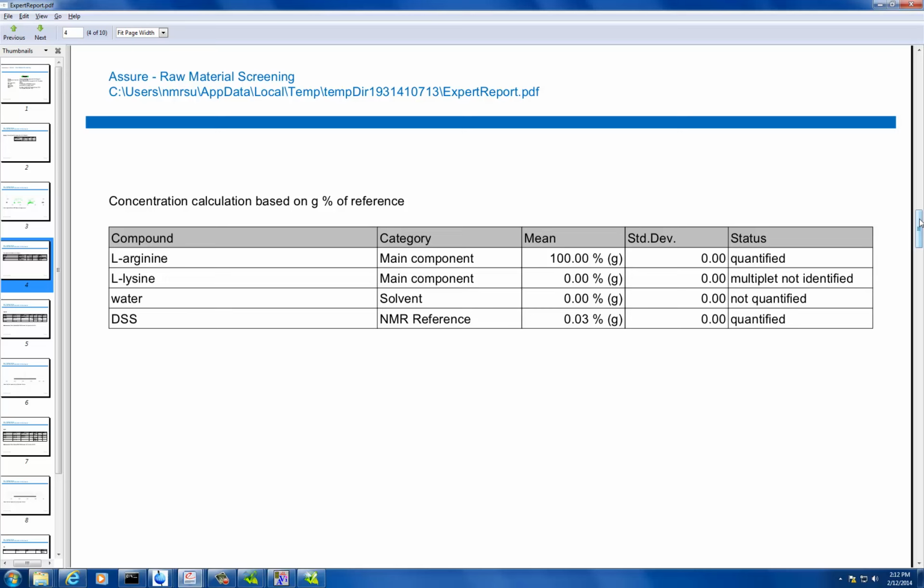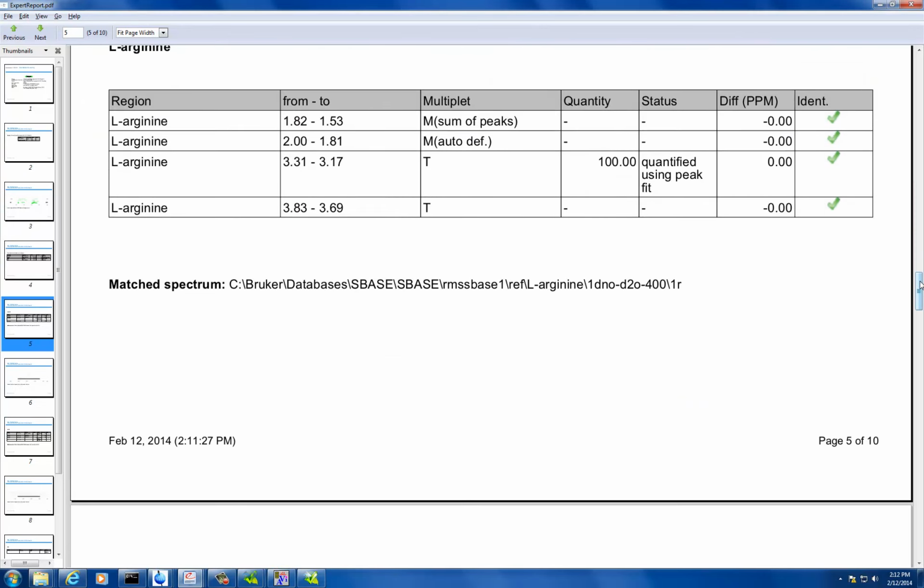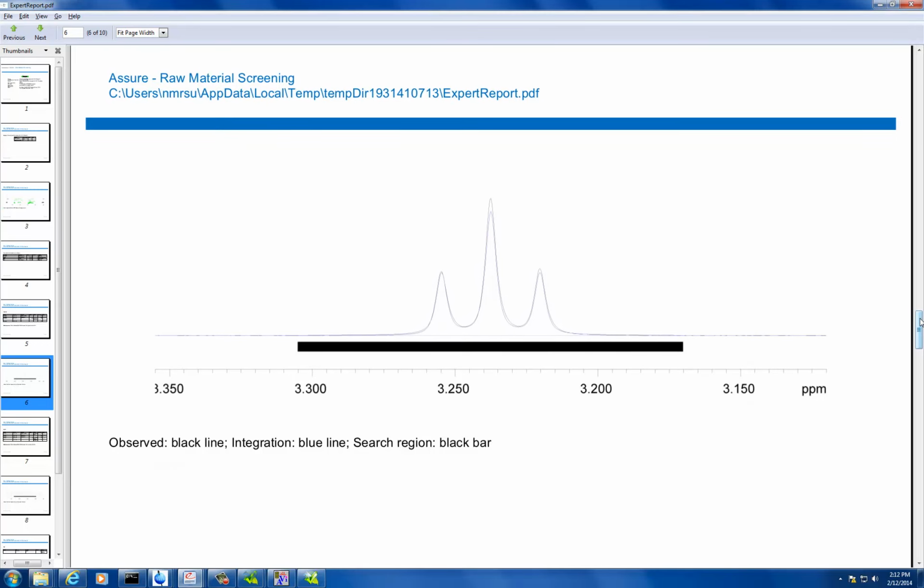Yeah. So we'll go down. So we unchecked for lysine. Yeah, we just did arginine and we unchecked for the lysine. But there was one area that you're still quantifying. Okay. But let's just scroll down and see what the problem was. Okay. So you see arginine, it's fine, it's happy. That's why they quantified. If we go down more, we found the triplet, great.